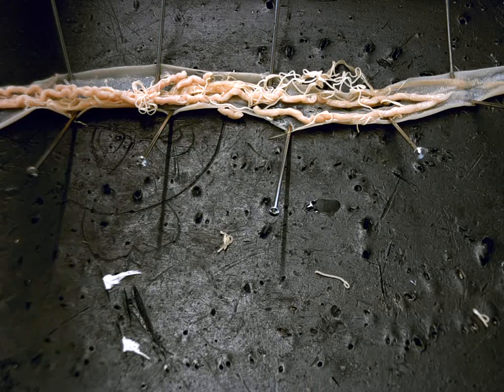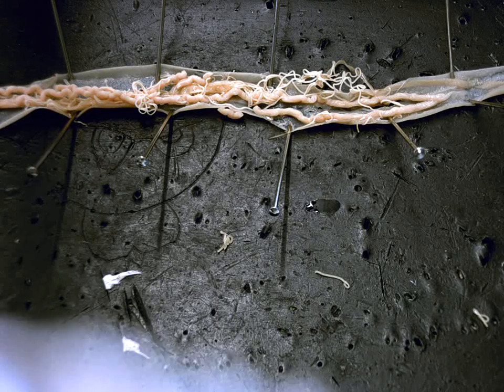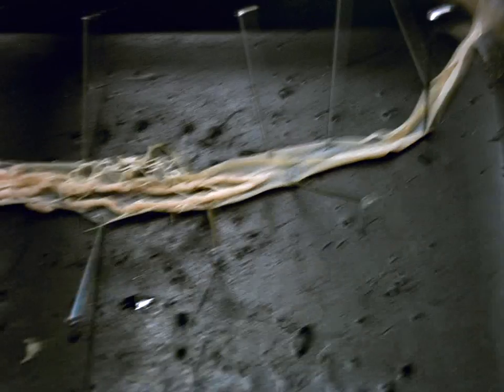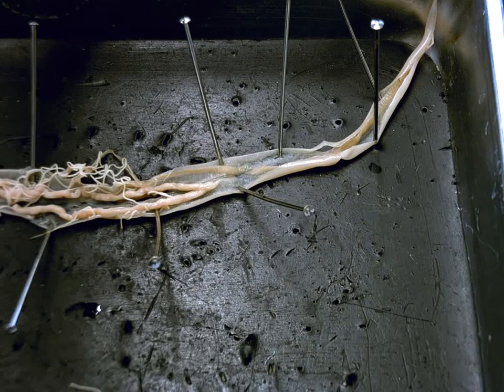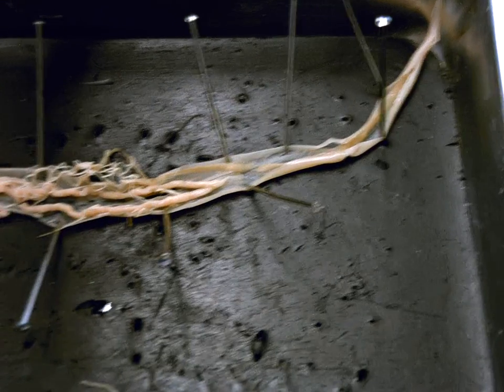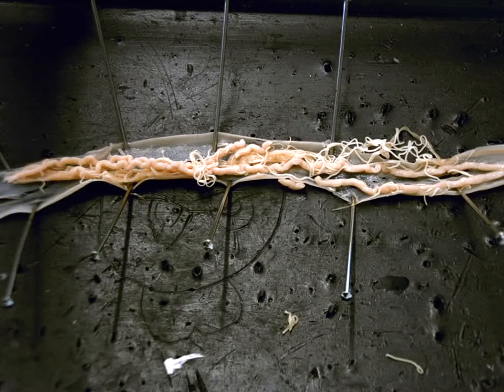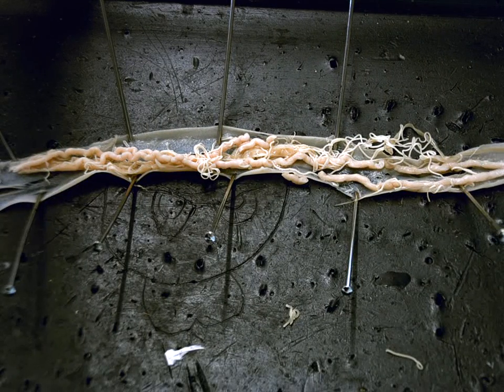Hi, so what we're looking at today is the female Ascaris worm, which is an intestinal parasite. So if I move the tray a bit, you can see her anterior region is way over here, see? And her posterior is way on this side. In between is all the body systems, which there's really only two inside of a worm.